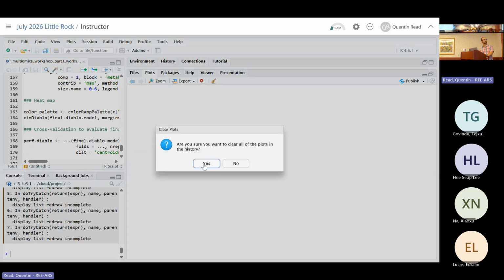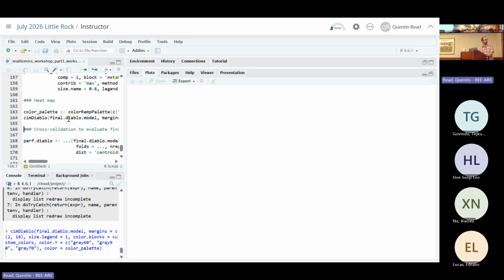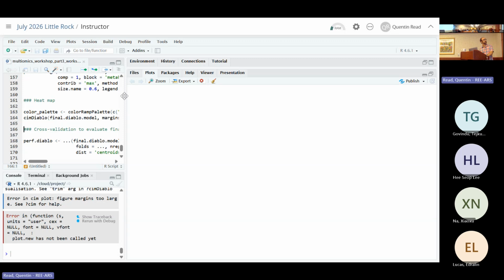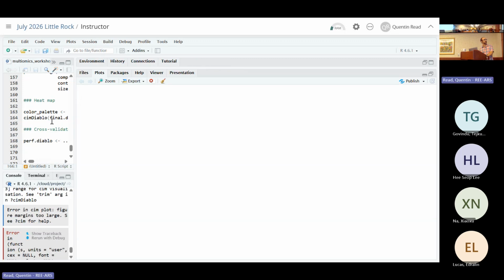If you're doing this on your own, you should be able to see it, but try that. It's still too large. You could save it to... Yeah, let me see if I can. No, that's not going to work. Let's make it even bigger. Yeah, if this doesn't work, I'll save it to an image.